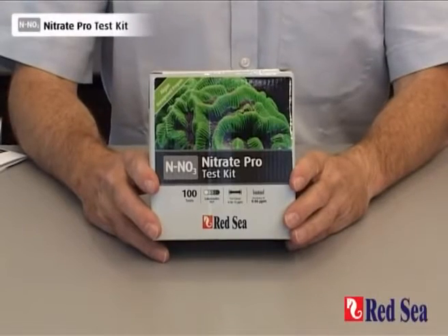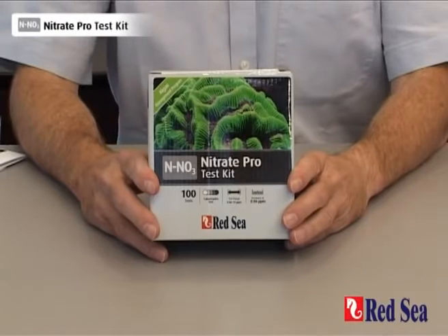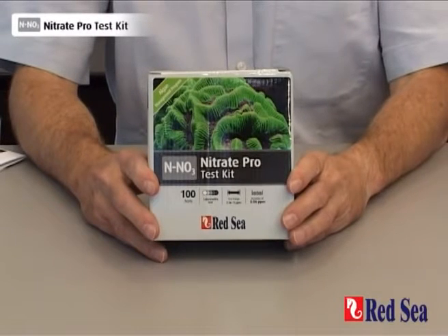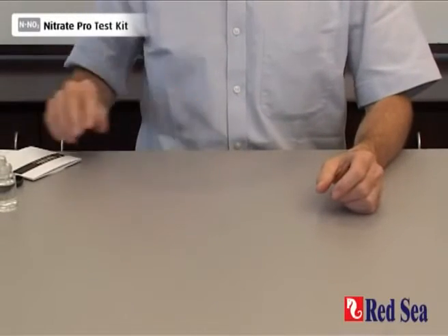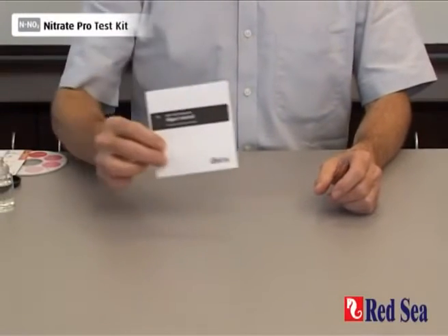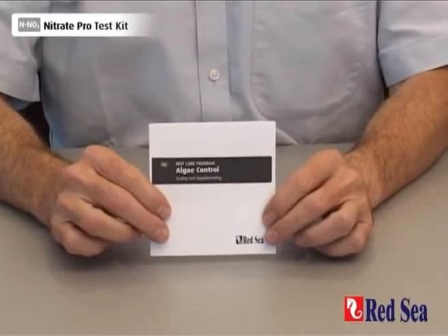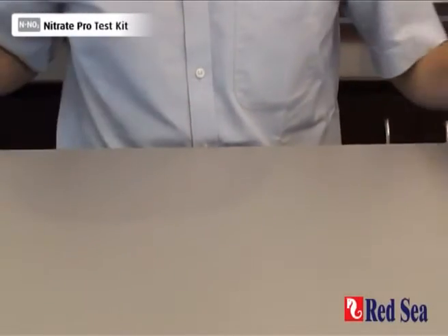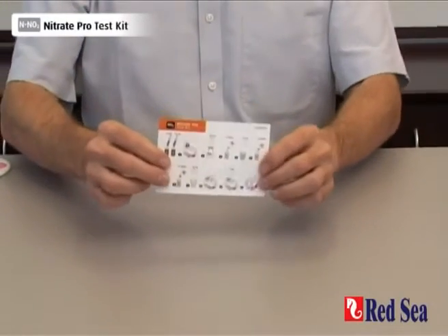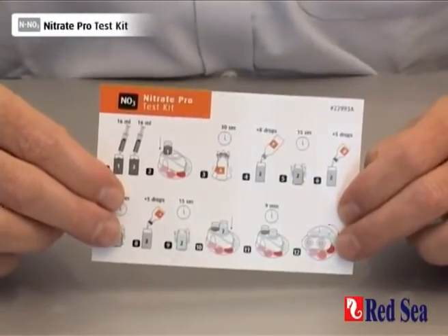Thank you for purchasing Red Sea's Nitrate Pro test kit. The purpose of this video is to demonstrate how the test is performed. Before doing the test for the first time, read the detailed instructions in the manual provided with the kit. There is also a set of easy-to-follow graphic instructions for when you're actually performing the test.